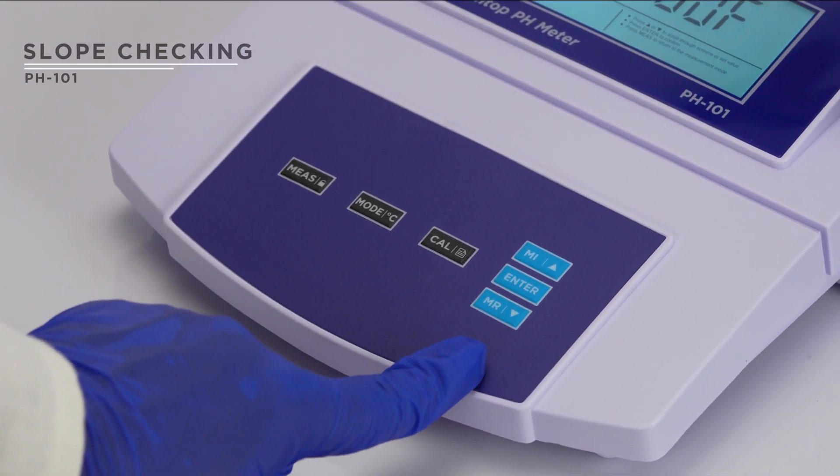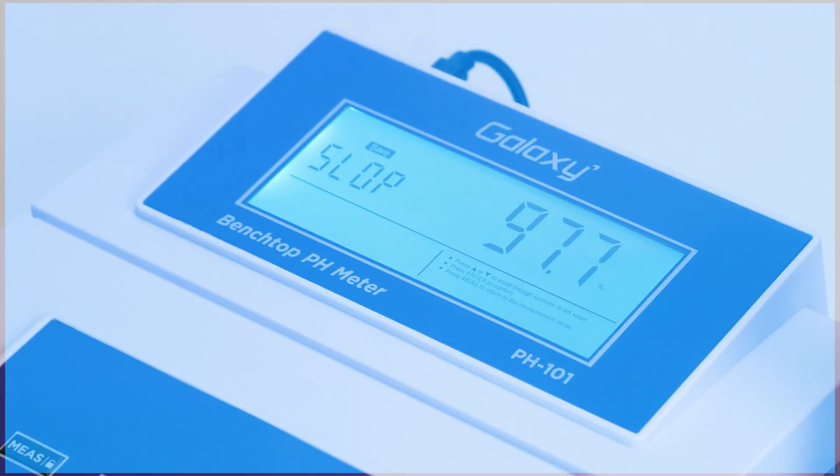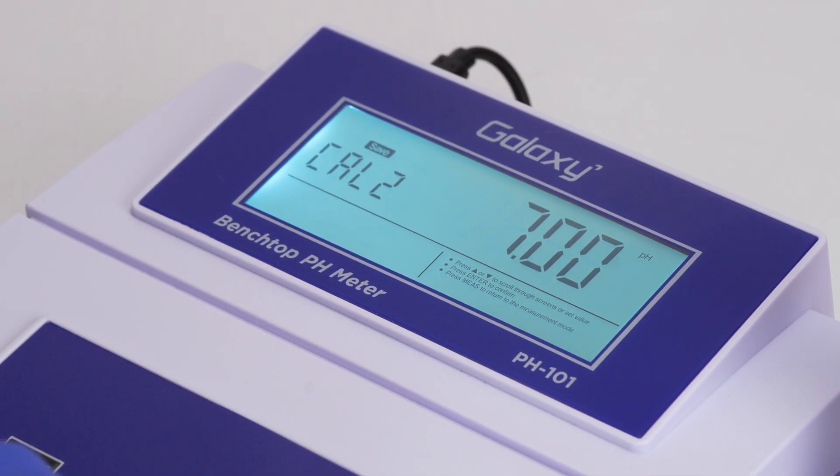Press the MR key twice, then press enter. After that, press the MR key again to check the slope of the electrode following the calibration.